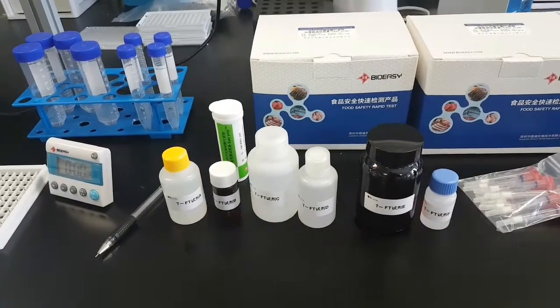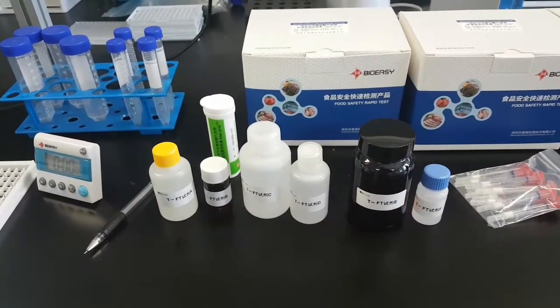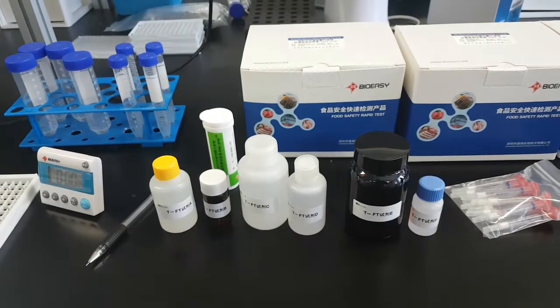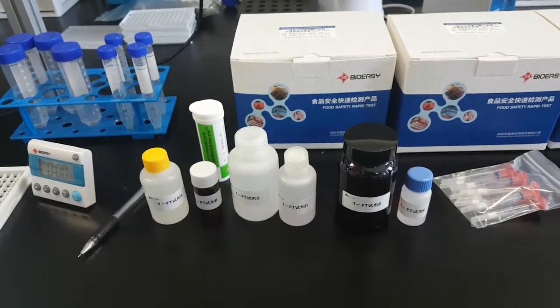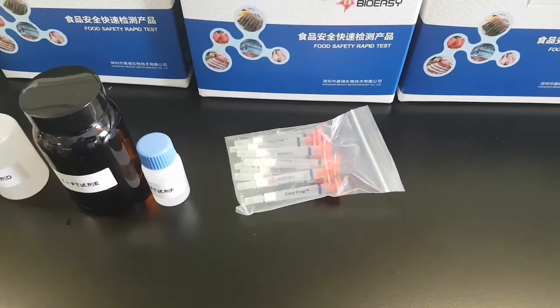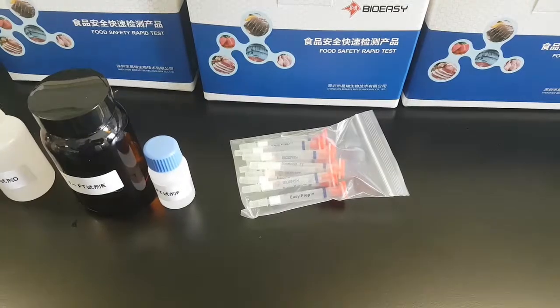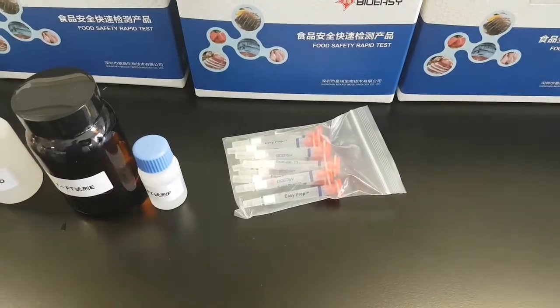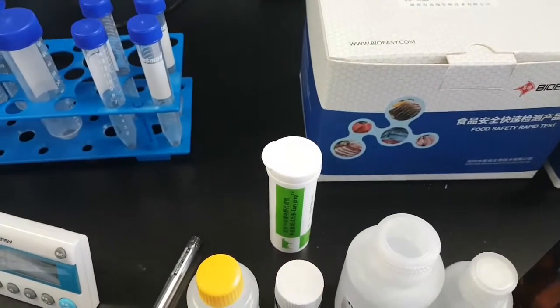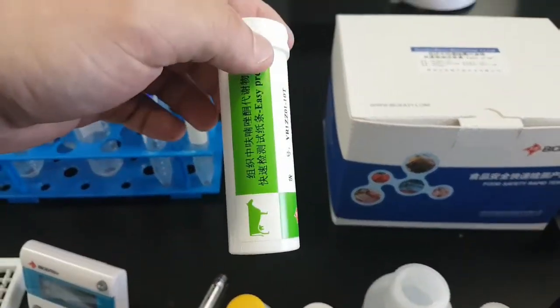Please pay attention that reagent D is ethyl acetate and reagent E is normal hexane. Also we get 10 extraction columns and one tube with 10 test strips and 10 red microwells.